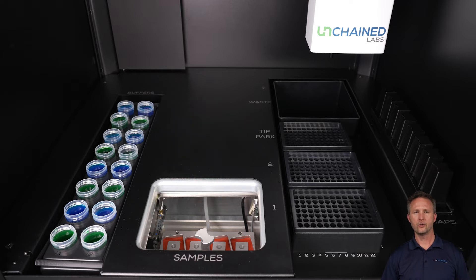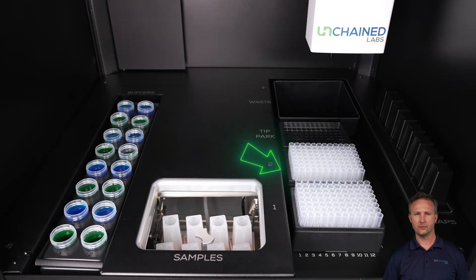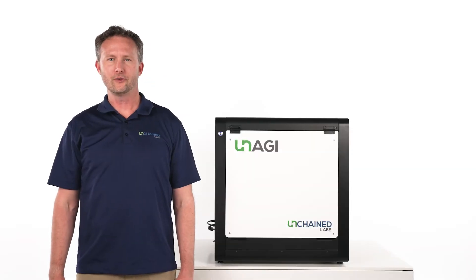You can see the UNA rack, where you can place up to eight UNAs per run in the chamber. Unagi also has an orbital mixer that will gently mix your samples during each buffer exchange cycle to give higher flow rate and recovery. On the right is where you can place up to two racks of tips. Unagi will automatically add new buffer or transfer sample using the pipette channel. On the right of the pipette channel is the ultrasonic volume sensor, which monitors your sample volume at every step in the process.